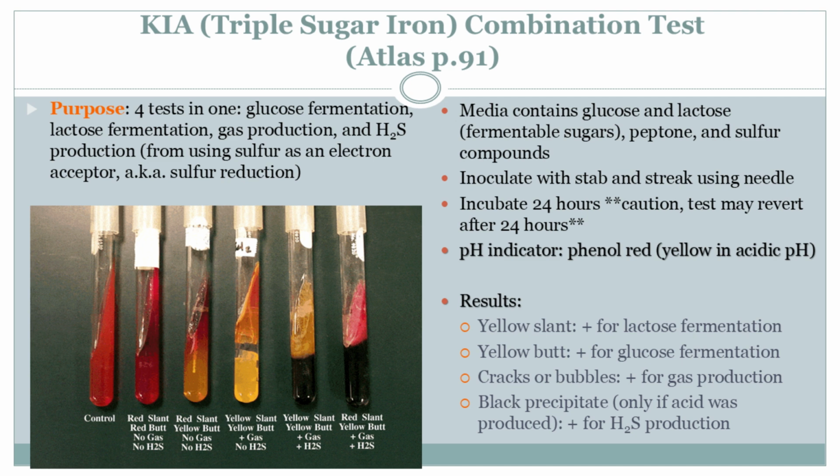Okay, so let's say we're looking at this test and it's really unexpected results. It doesn't match up with any of the things that we usually see. What does that mean? Is that bad? Not necessarily. It just means we have to investigate further. It could mean that we found a new species of bacteria that we've never seen before.